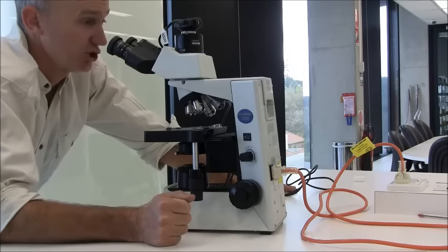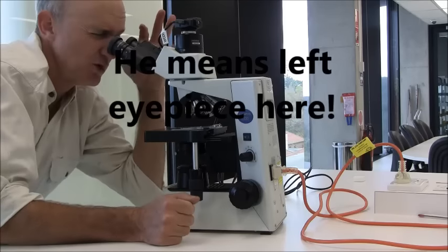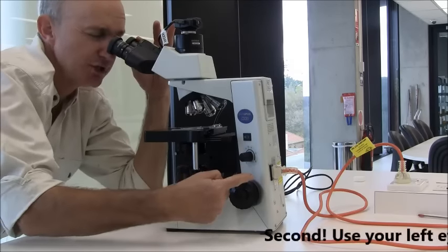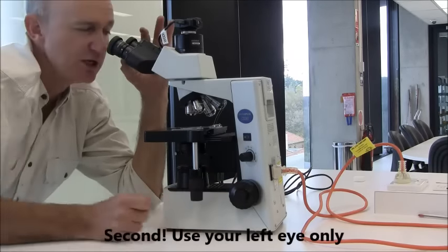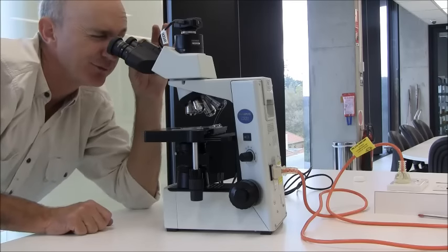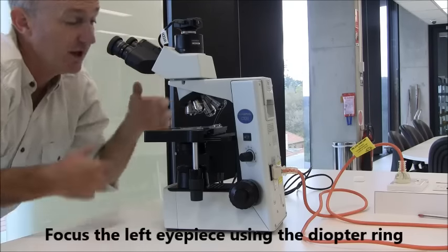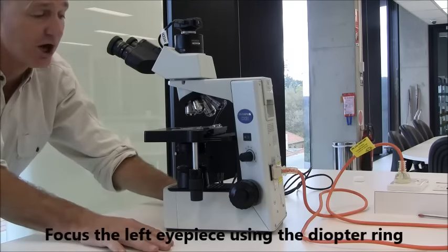And then, shut your right eye, just looking through the left eyepiece, refocus, but not using the focus controls on the body, using the focus control on the left eyepiece itself. So you rotate that until the image is sharp, and now it's focused for both of your eyes.